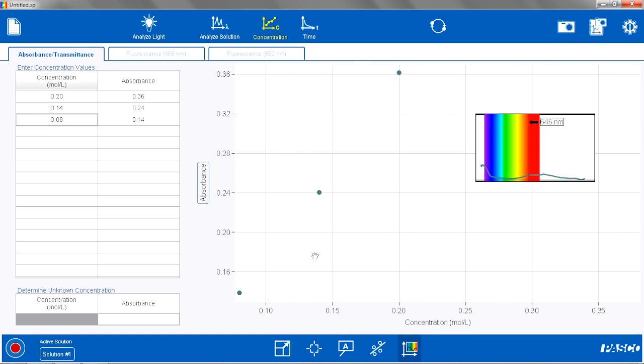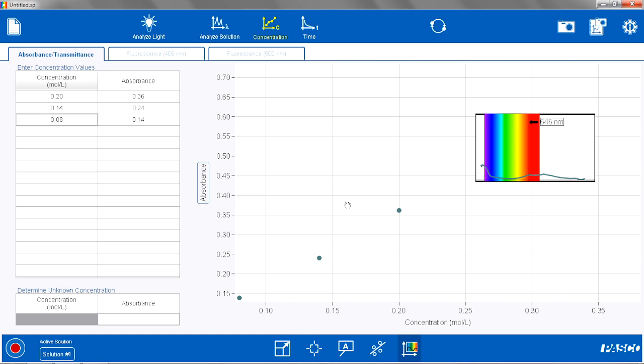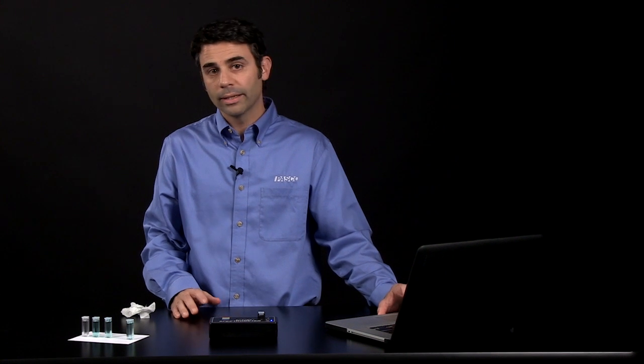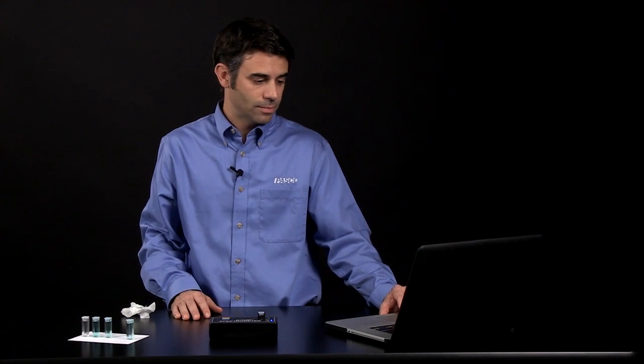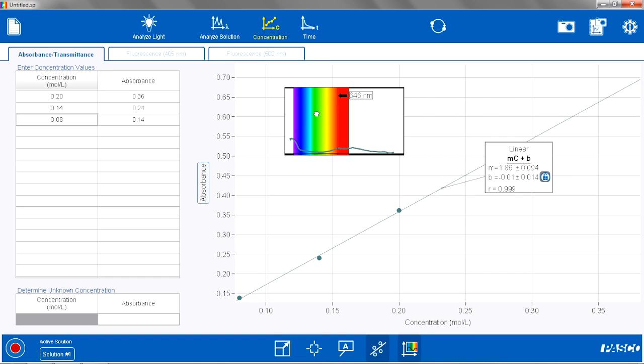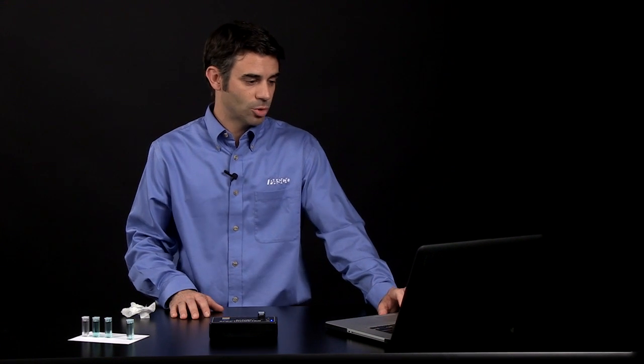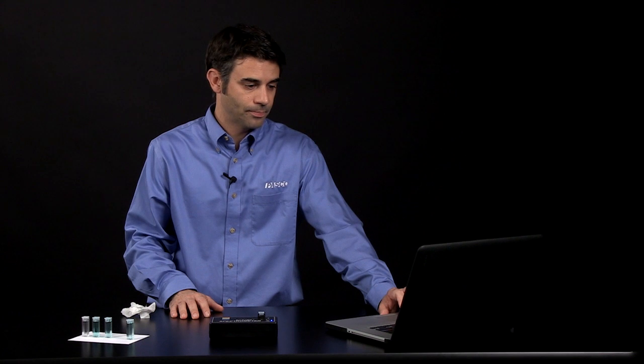I am going to rescale it a little bit so we can see the graph and the full spectrum better. I am going to apply a linear fit to that. I am going to show a linear fit. I can see my linear fit with the slope, the intercept, and the R value of 0.999. Pretty good fit for those concentration and absorbance values.